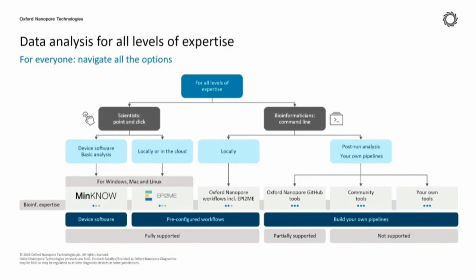Other than that, for nanopore sequencing, we have a lot of users. So that's why the bioinformatics tools developed to analyze nanopore sequencing data are quite a lot right now. Many developers have shared their programs through public repositories such as GitHub.